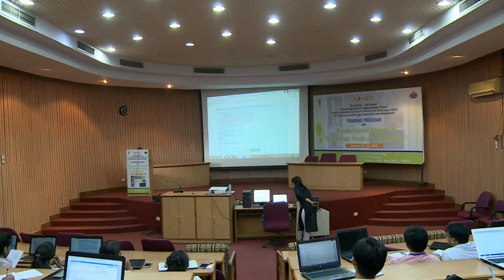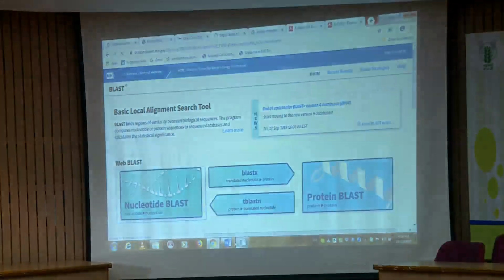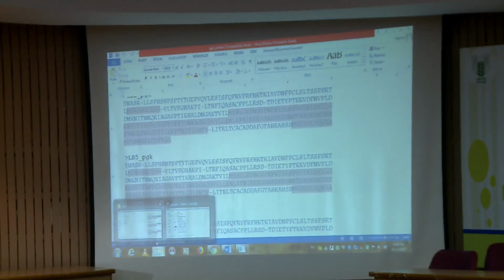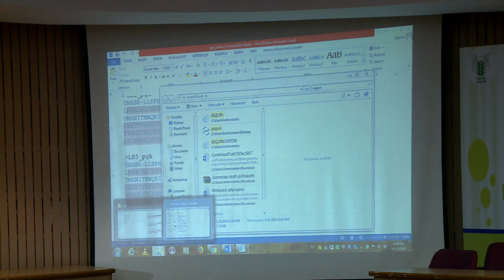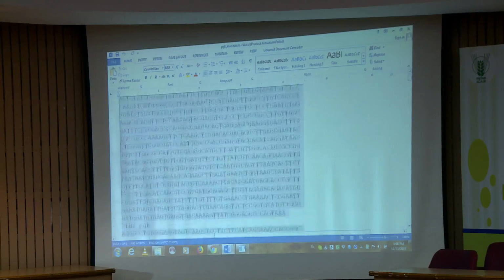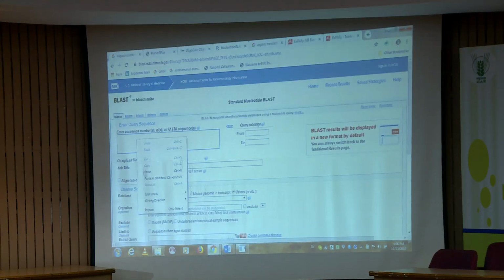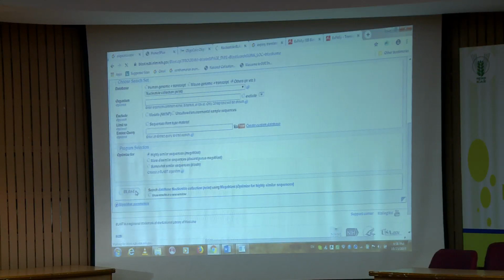You go to NCBI BLAST. While doing the BLAST, there is one option, I'll show you.